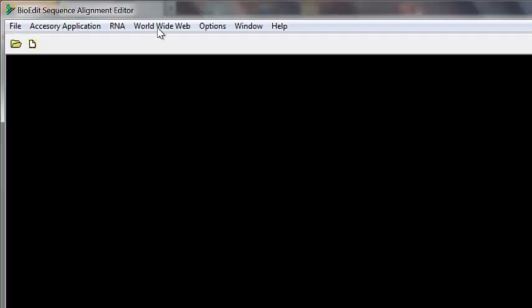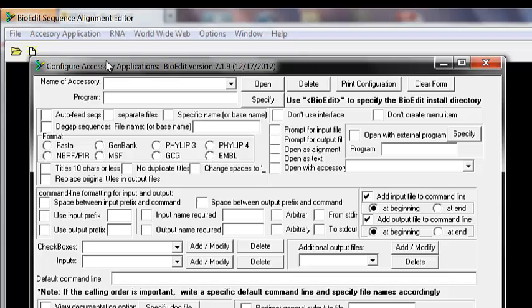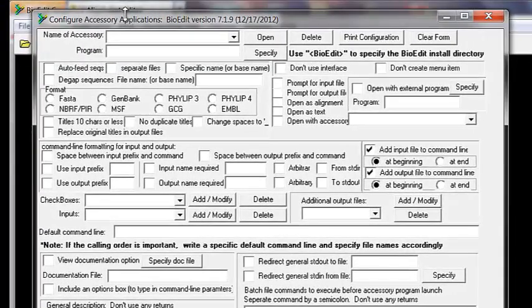Once you have it pasted into the BioEdit Apps folder, go back to BioEdit, go to Accessory Application, and select 'Add/Remove/Modify Accessory Application.' This opens a small option window where you can specify what kind of program you are adding, what kind of input and output it will produce, and any other options the program needs to run.